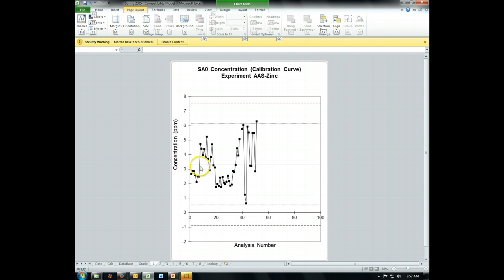Now I will let you in on a little bit of insight. This cluster is from one semester. This is for a different semester. This one's another semester. This is a different summer semester, so a smaller number of points. And then this is one more term. Now you kind of get the feel that maybe the reagents were prepared differently, and that's one of the reasons that you have a complete offset in the measurement. That would be a pretty reasonable interpretation of that. Okay, so I've given you 3 of the reasons that you'd shut down already.